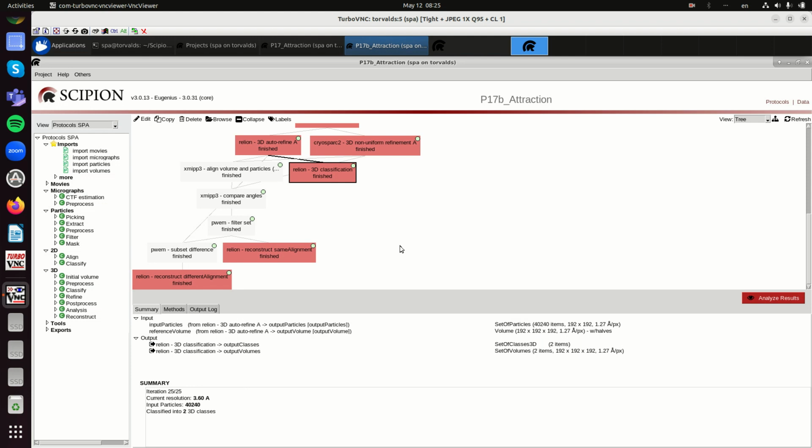Here we had these two structures intermixed, and you were not able to separate them by 3D classification. This is an expected result, because let's say half of the particles are incorrectly aligned, the other half are correctly aligned. When you randomly split at the beginning, each of the two classes will have this 50-50% mixture. If you let them evolve, the two structures are so similar that particles cannot decide which of the two to go to. So they don't separate, and the two initial classes stay where they are. This is a local minimum of the goal function that we are optimizing.